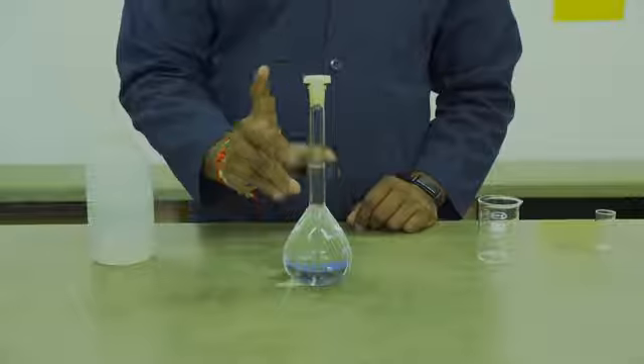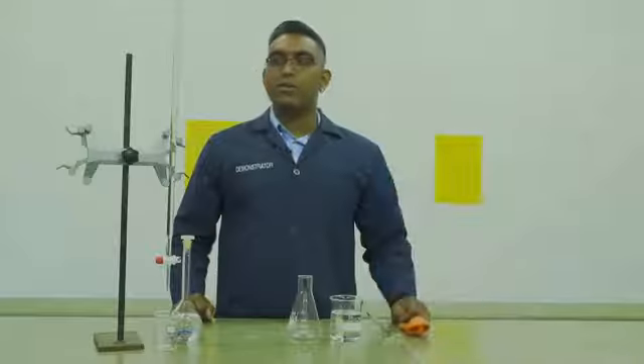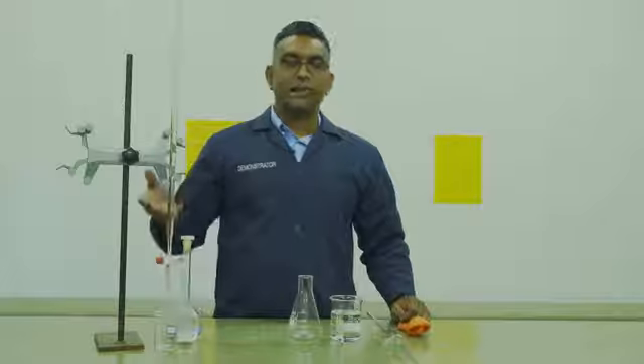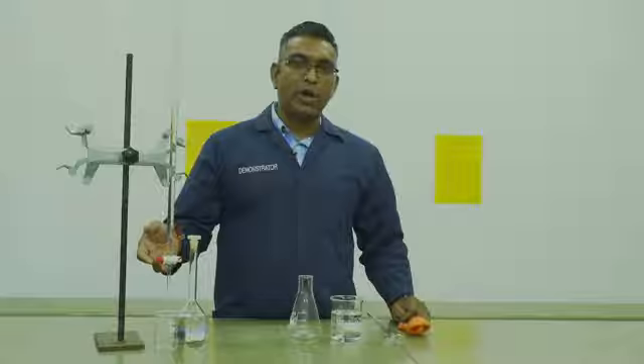This is now your standard EDTA solution. You will then prepare your burette as you have done in A1 using your EDTA solution. Ensure that you have no air bubbles in the jet.